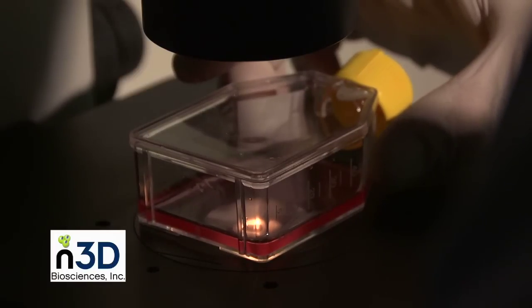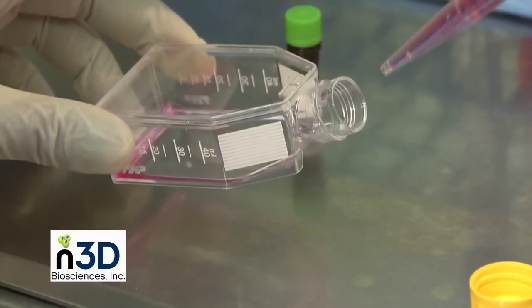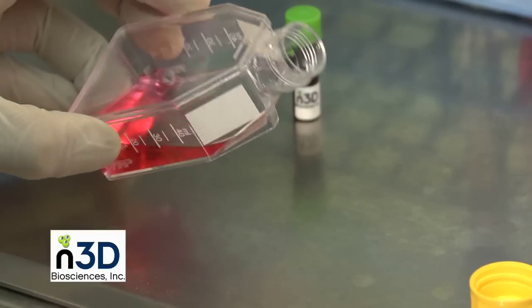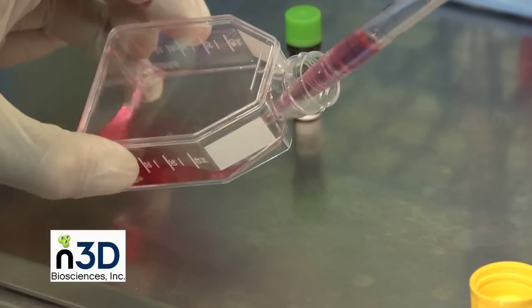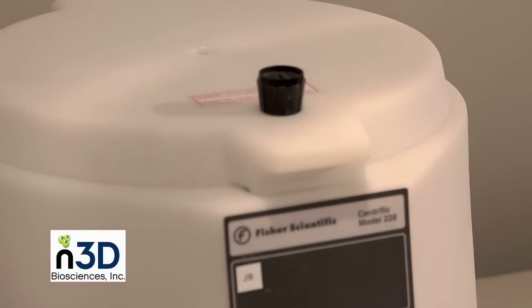We recommend checking that the cells are adequately detached using an inverted microscope. Proceed quickly to the next step since, as in normal cell culturing procedures, the trypsin EDTA solution can adversely affect the cells if left too long. Next, deactivate the trypsin EDTA solution by adding media containing serum or trypsin deactivating solution. You should make sure that the volume added is at least 10 times more than the volume of trypsin EDTA that was used. Some cell types may require centrifuging to assure trypsin is removed prior to levitating cells, such as cells cultured in serum-free media.